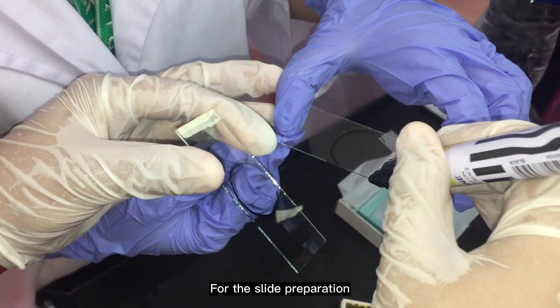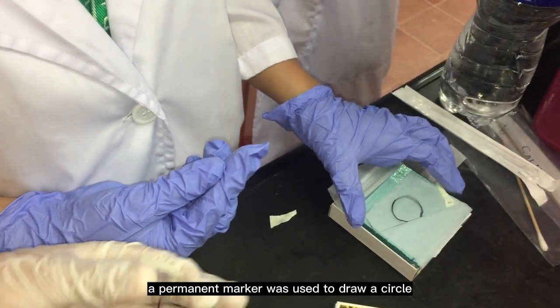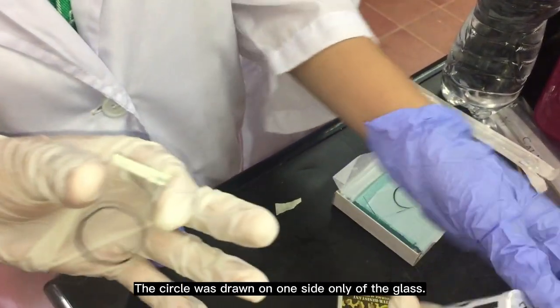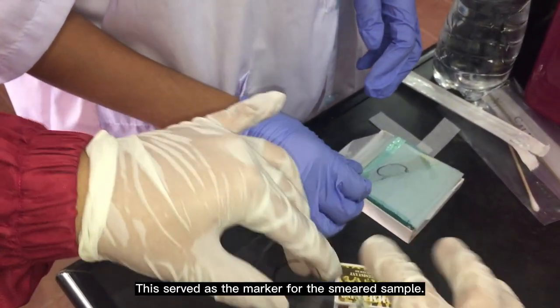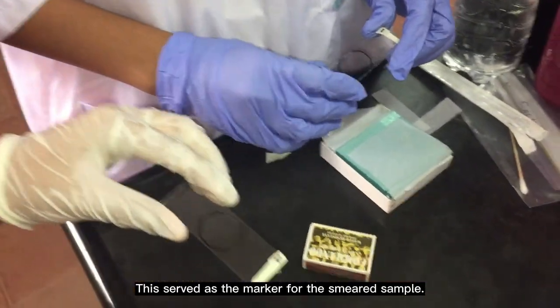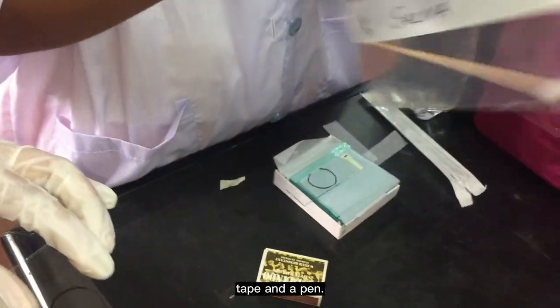For the slide preparation, a permanent marker was used to draw a circle at the center of the glass slides. The circle was drawn on one side only of the glass. This served as the marker for the smeared sample. After that, the glass slides were labeled using paper tape and a pen.